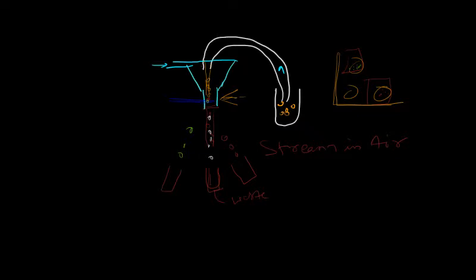Let's look at the process now. This is a general anatomy. There are voltage plates, and this is how it happens. So let's dive deep into this component. I'll start from the flow cell. Okay, so this is a flow cell.